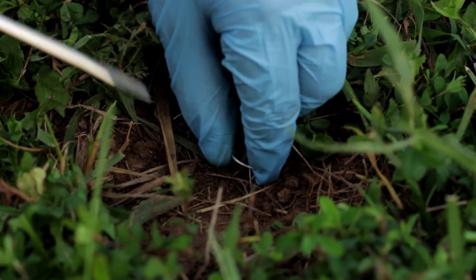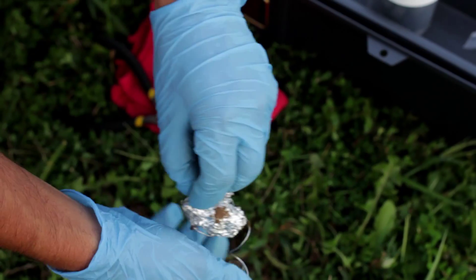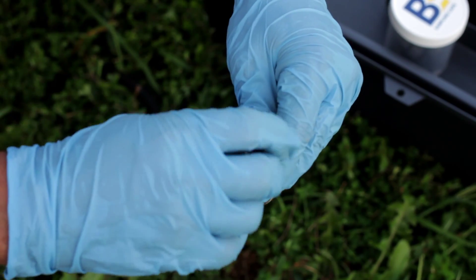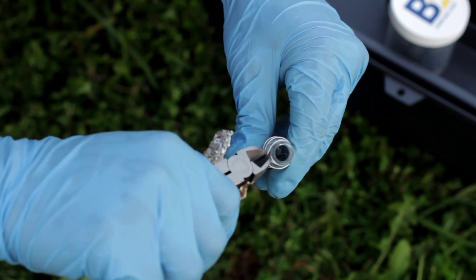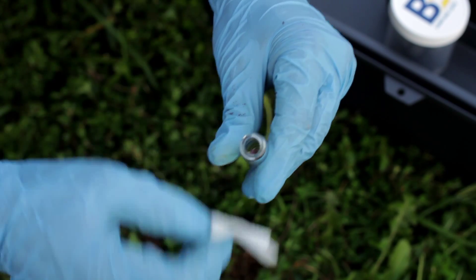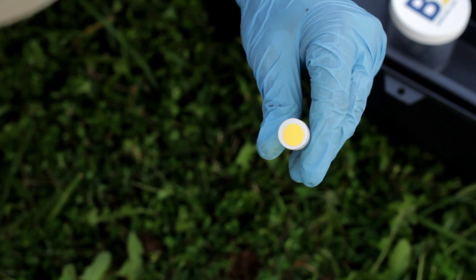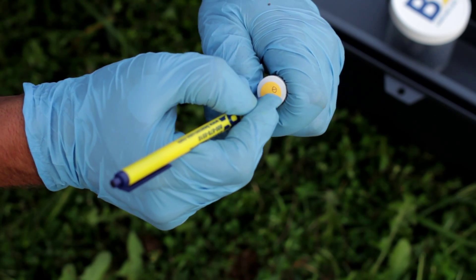Using the screwdriver, remove the aluminum foil plug and retrieve the sampler from the ground. Holding the sampler upright, clean the sides of the vial with the clean towel. Remove the sampling cap and cut the wire from the vial with the wire cutters. Next, clean the vial threads completely with the gauze cloth. Take the solid shipping cap from the kit and screw it onto the sampler. With a ballpoint pen, record the sample number ID corresponding to the sample location on the cap's label.